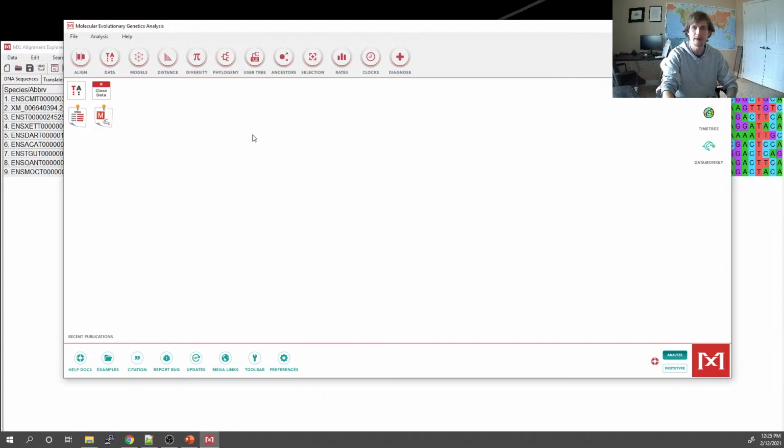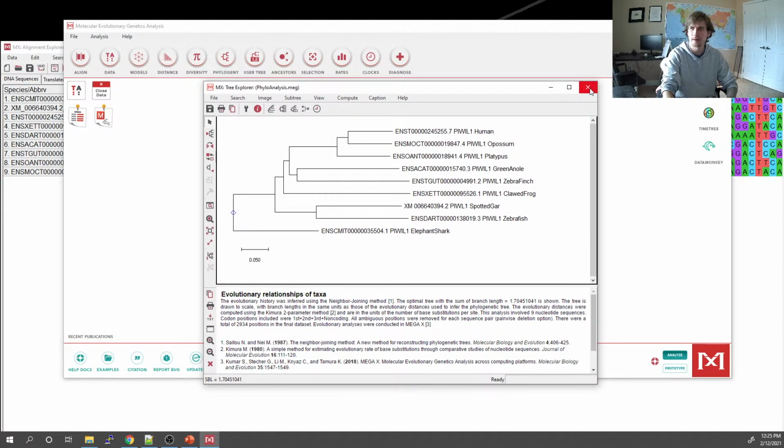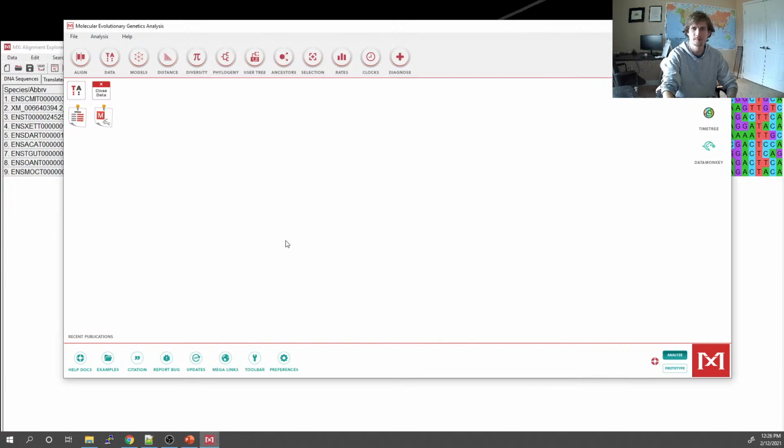You can get rid of that Newick. I'll leave that tree there. Cancel. All right.